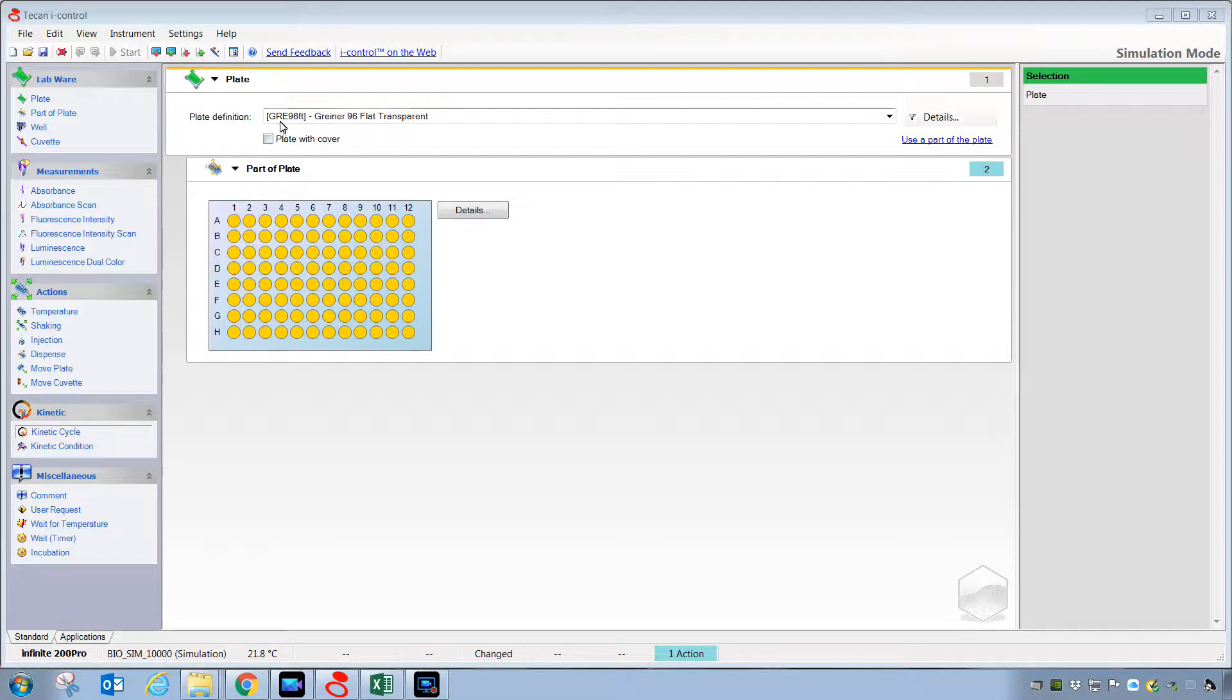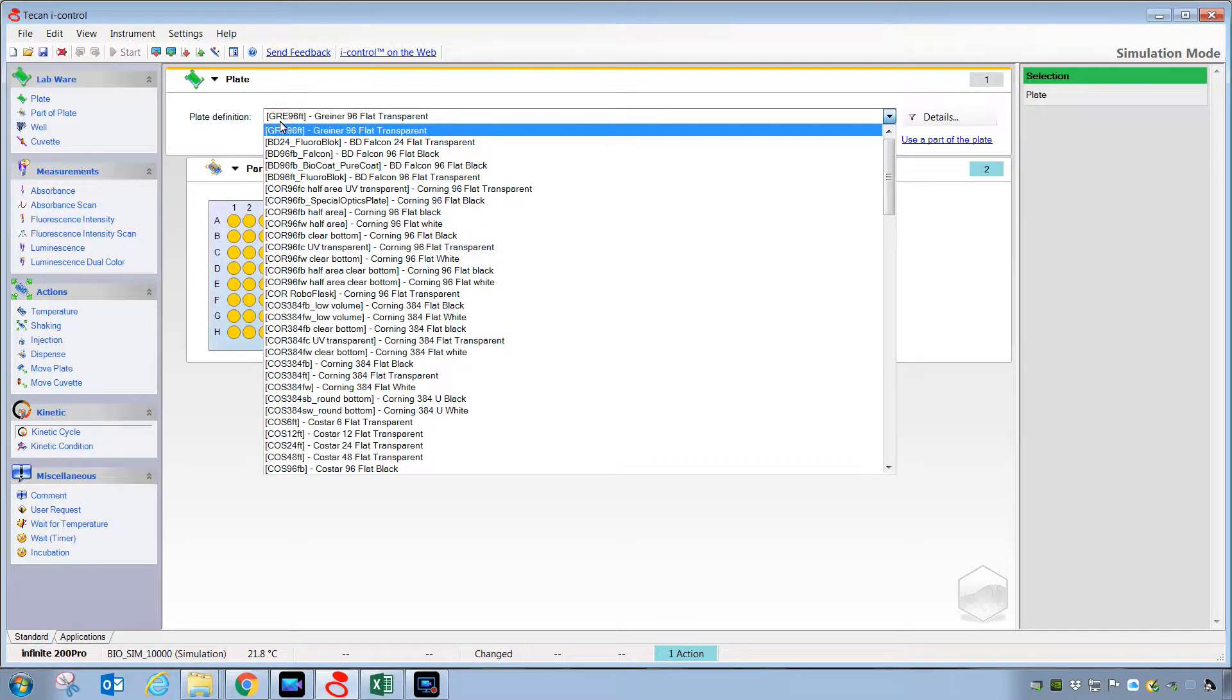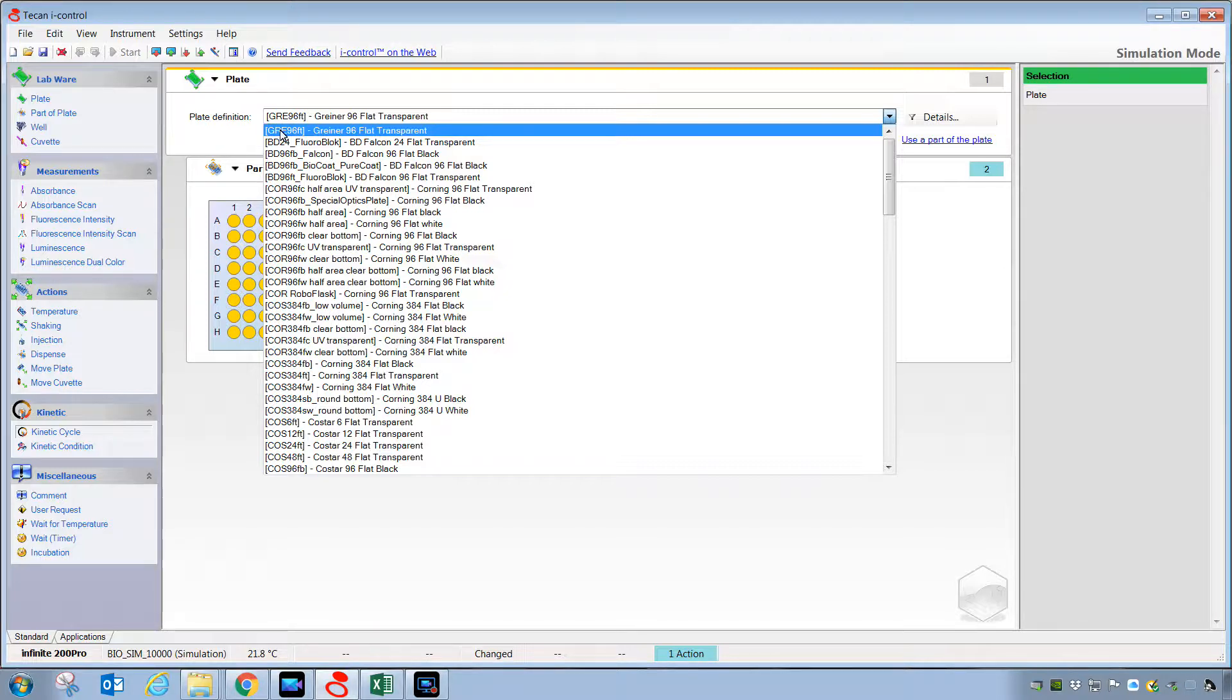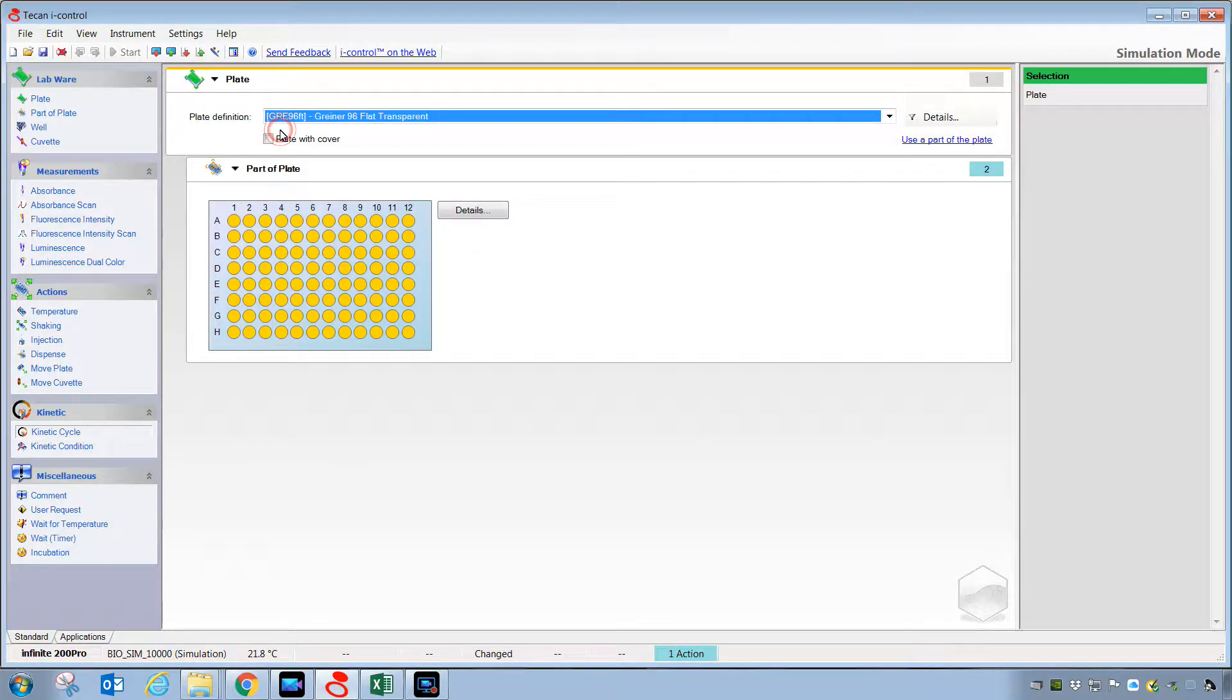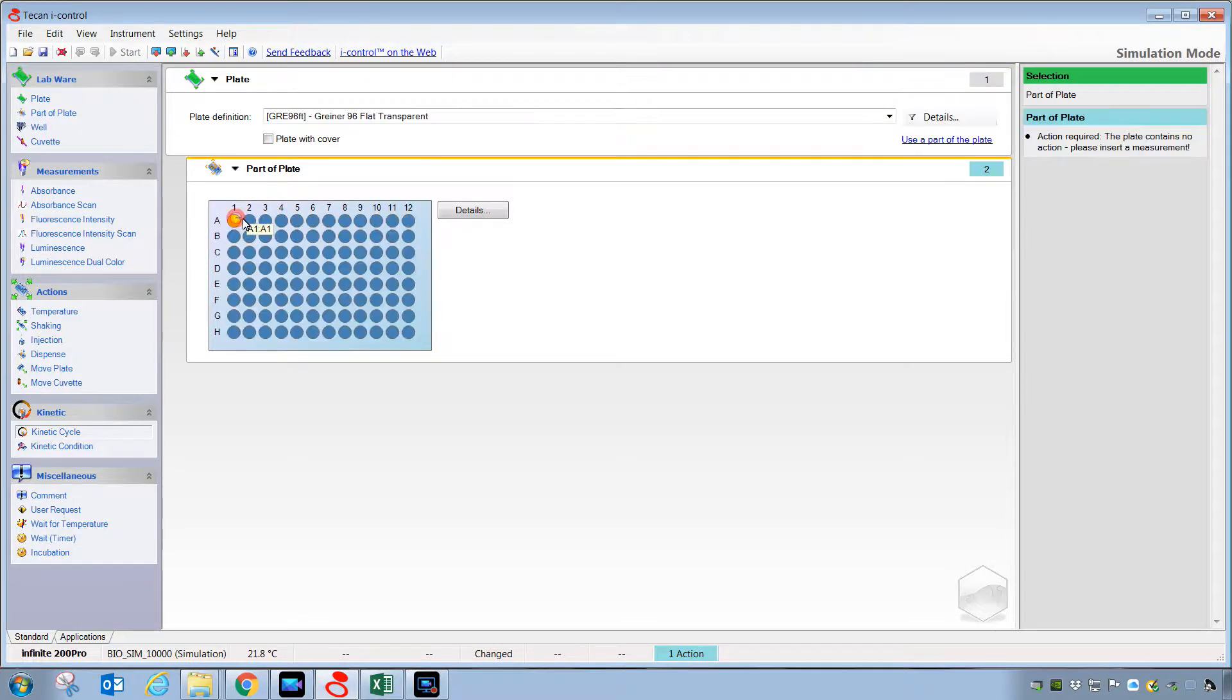Our first step will be to select a plate definition that matches the plate we intend to use. For this example, I'm going to pick a Griner flat transparent plate. The next step is to select the wells that we want to measure.